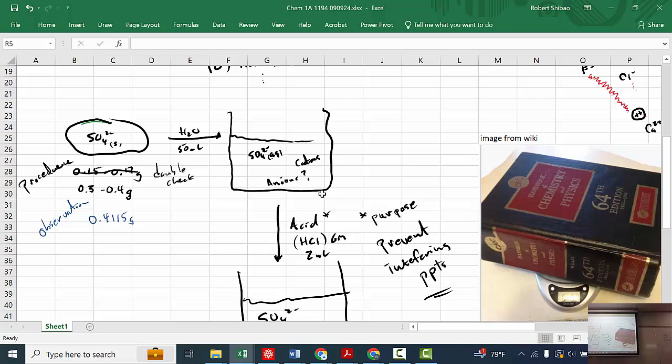Since that accident happened, we have this. So initially, if you spill something, you could do this. This is the public shower, but we have a private shower. The private shower is located behind the lecture room. And so you get most of it off here, and then you can go over there and make sure it's off completely. The acid, that is, completely off your clothes and your body. Or whatever other contaminant that we have.